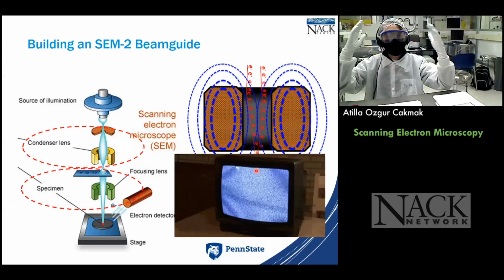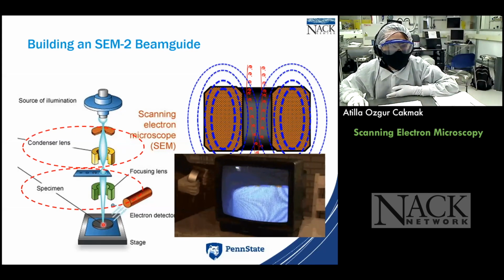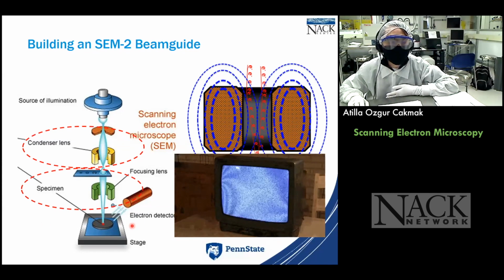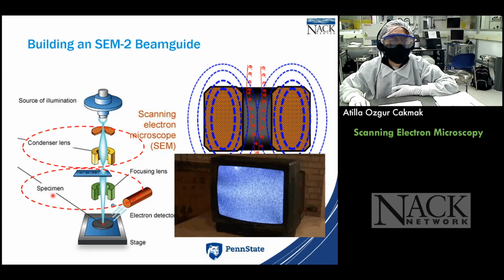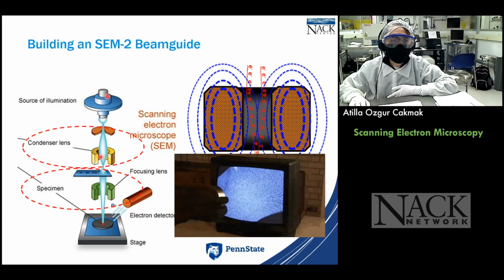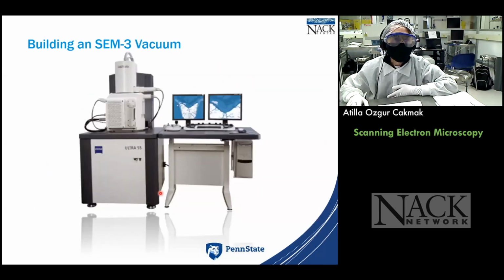What's the main purpose? Let's remember. Create the electrons and send them mostly onto the sample, the wanted region, not the unwanted regions. Okay, so that's where these lenses come into play. Now we know the illumination source, we know how we guide the electrons, that's all good, but is that enough? No, we can't do this. We can't do this all in free space, right?